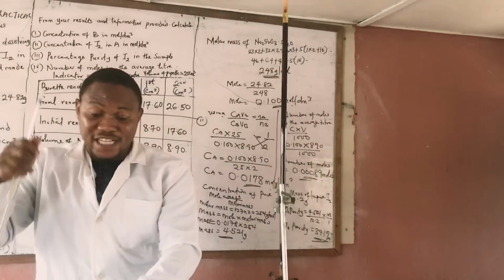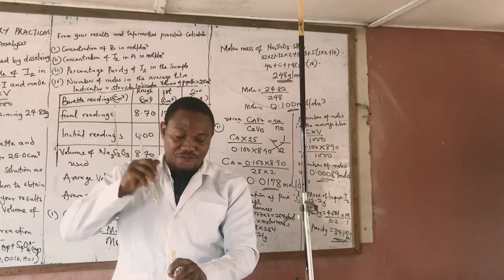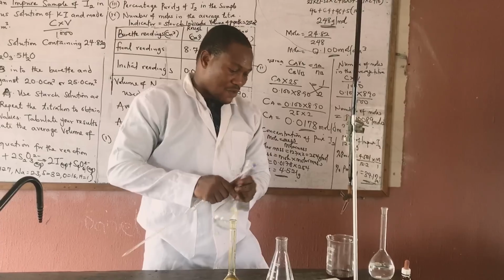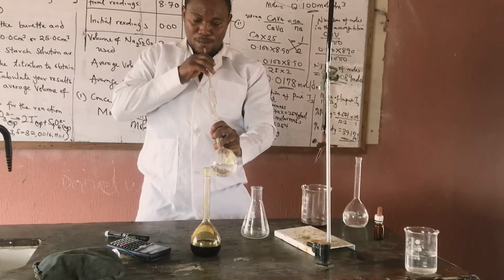We just go by the specification Waec gave and just see how the question is going to unveil on that day. So let me pipette this now. No, I'm adding this one now. So let me pipette this.